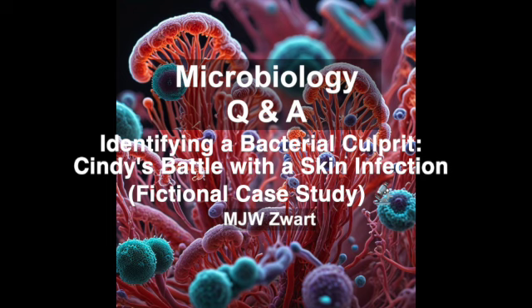You're absolutely right. Bacteria are notoriously tricky to visualize. They're practically transparent, so viewing them under a bright field microscope can be a real challenge. It's like trying to find a needle in a haystack. Exactly. But the lab technician had a trick up their sleeve. They decided to use a technique called dark field microscopy. Dark field microscopy. Tell me more. So instead of shining light directly through the sample, dark field microscopy utilizes a special condenser that blocks the direct light illuminating the background while leaving the bacteria brightly lit against a dark background. Oh, that's clever. It's like trying to see stars at night. They're so much easier to spot against a dark sky.